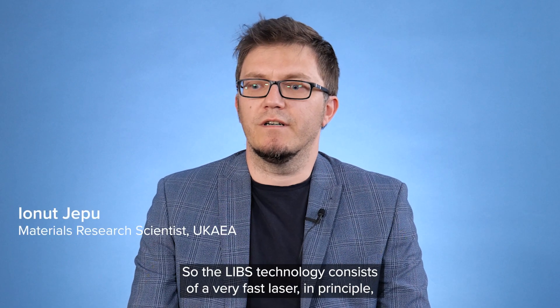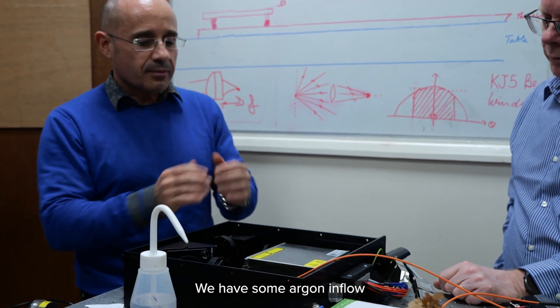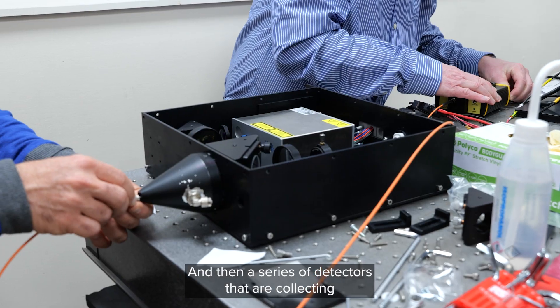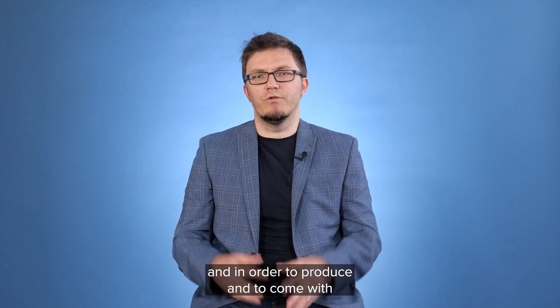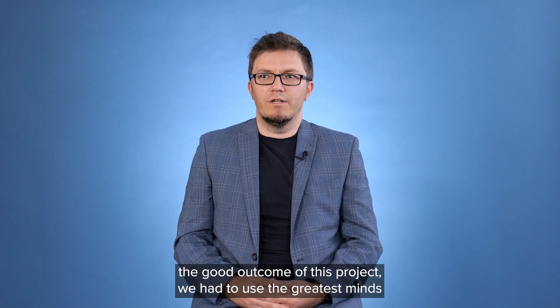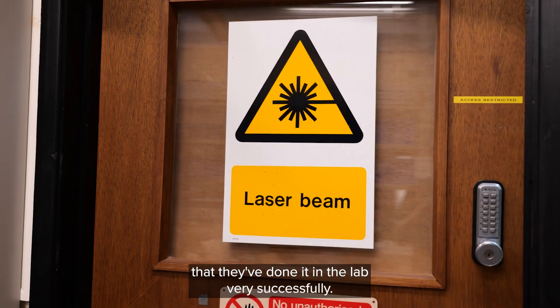The LIBS technology consists of a very fast laser and a series of optics that focus the laser on a specific target. We have some argon inflow at the region of the actual target, and then a series of detectors that collect the light created via these laser pulses. This is a huge team effort, and to produce a good outcome for this project, we had to use the greatest minds available — specialists for these types of diagnostics who have done it in the lab very successfully.